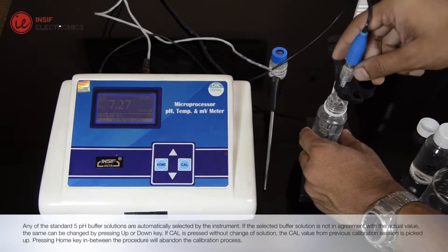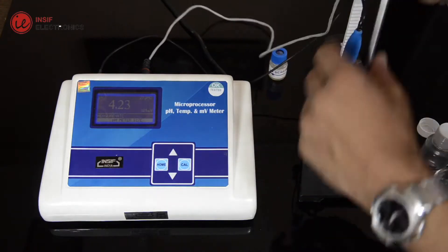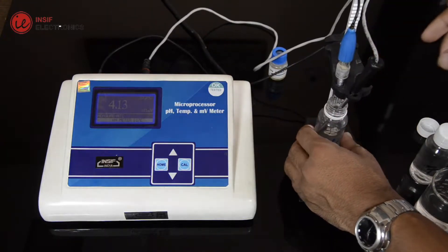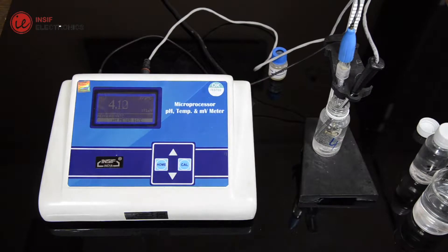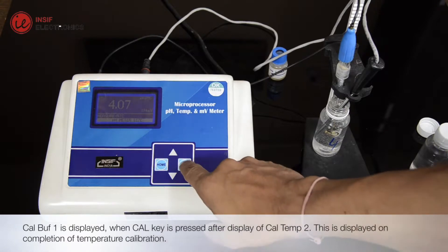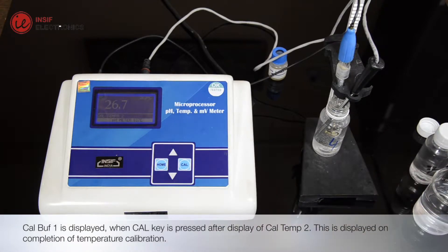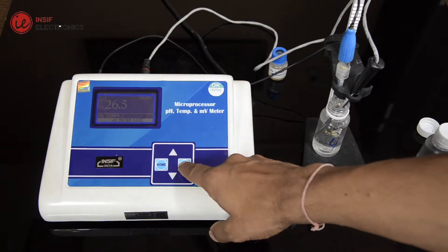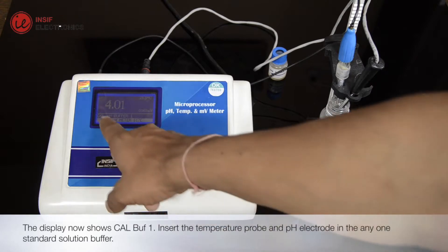Pressing home key in between the procedure will abandon the calibration process. CalBuff1 is displayed when Cal key is pressed after display of CalTemp2. This is displayed on completion of temperature calibration. The display now shows CalBuff1.